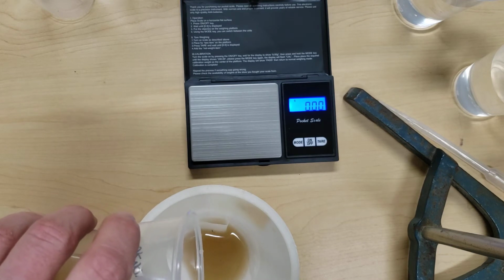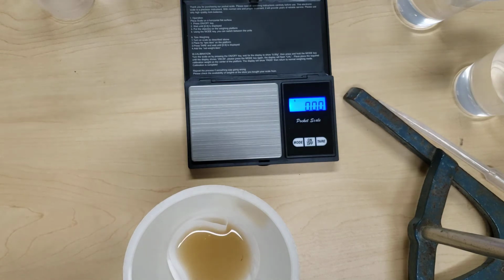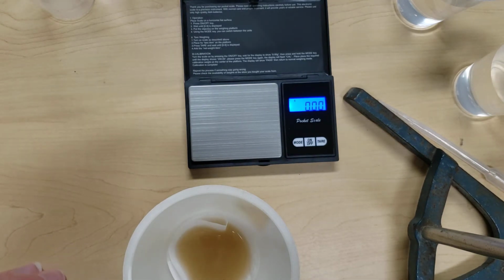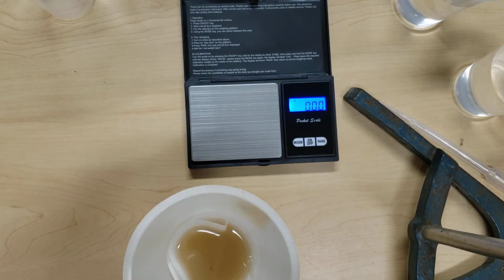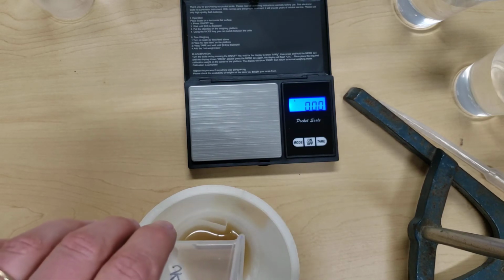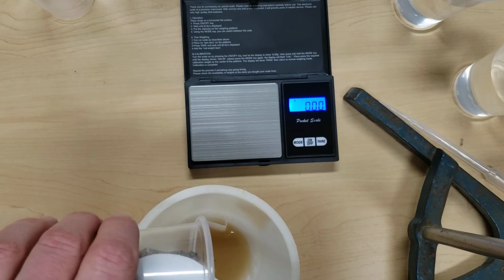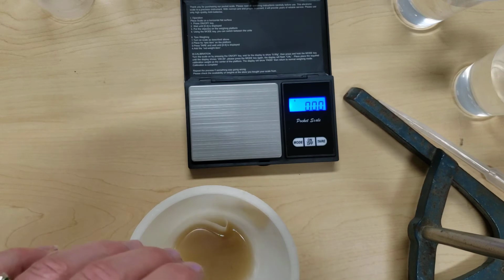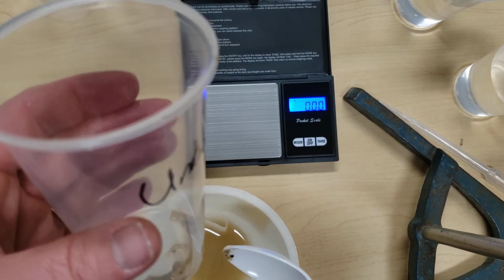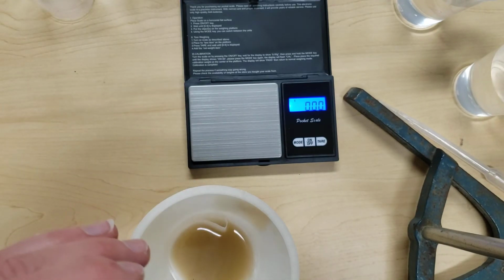And our goal is to remove all of the salt down into our second container. And this does take a little bit of time. Once you wait patiently for that liquid to filter through, you can transfer that sand down into that filter paper in the funnel. Now there may be some sand left in the bottom of your container. You want to try and scrape out as much as you can.